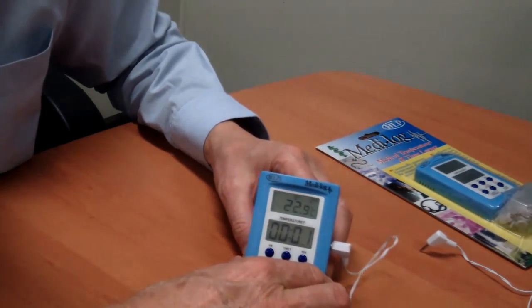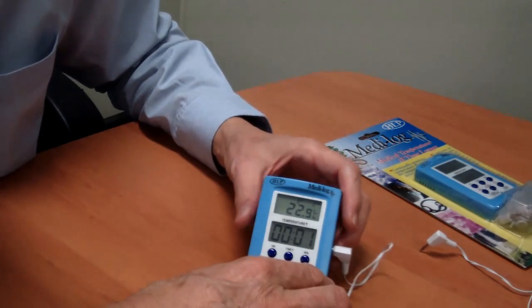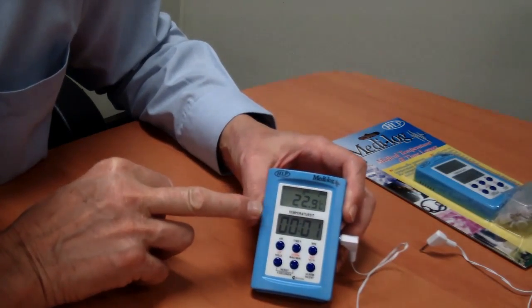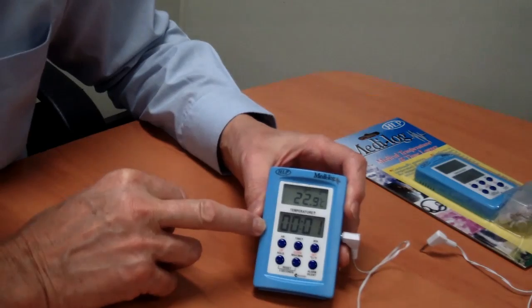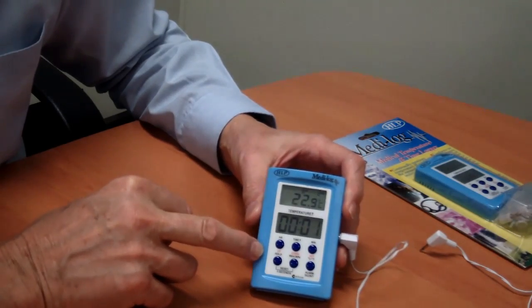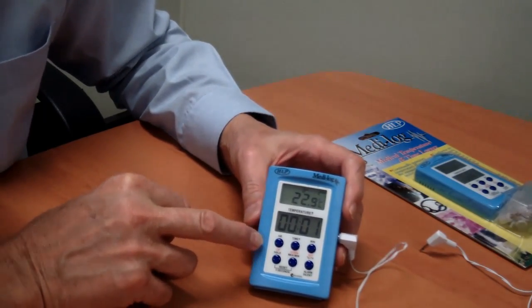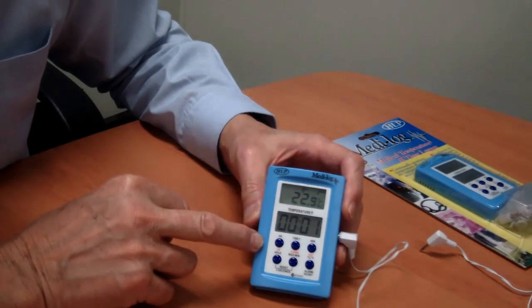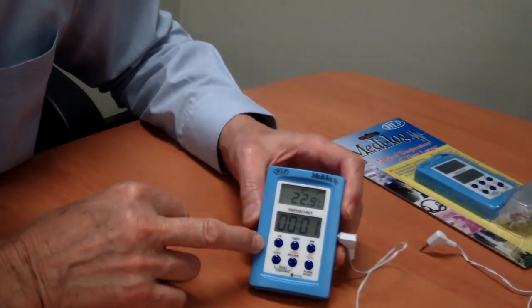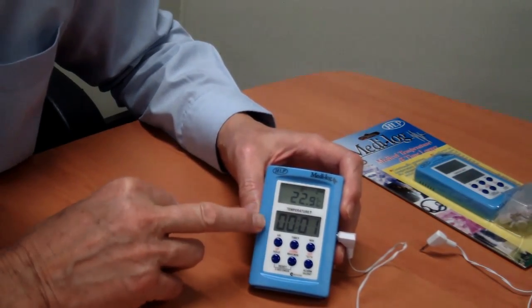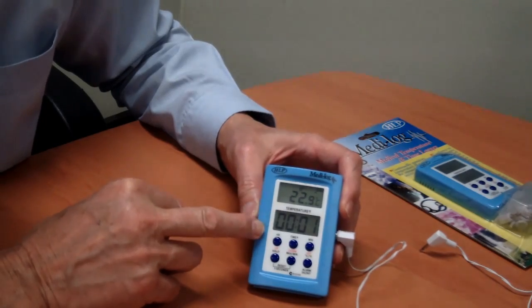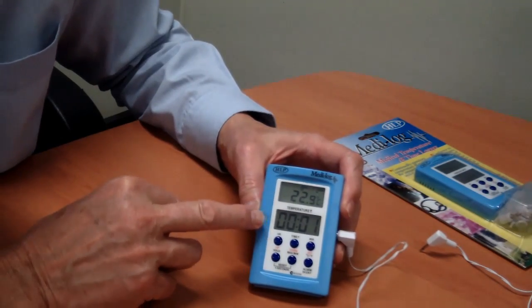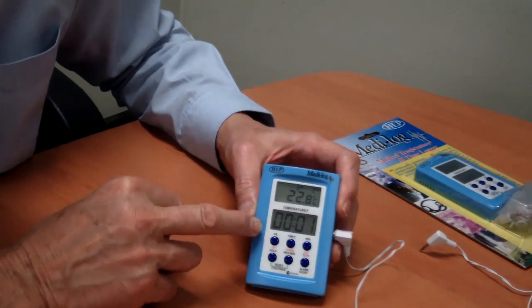The beauty of this unit is it's quite intelligent. It will beep like that for a period of 30 minutes, then it will realize that maybe it's after hours, there's no one around, so it will delay the beeps and will only beep once every 10 seconds. If after a period it then decides there's no one around, it beeps once every 30 seconds.